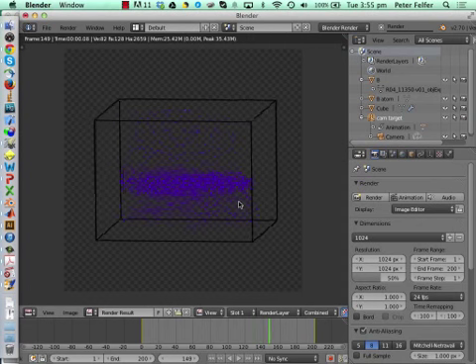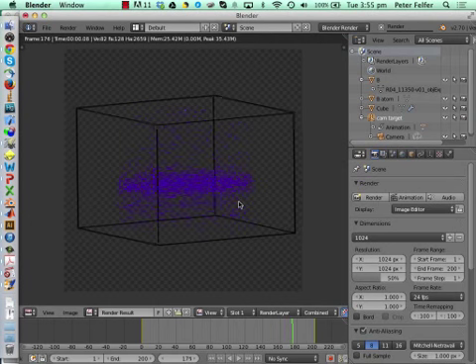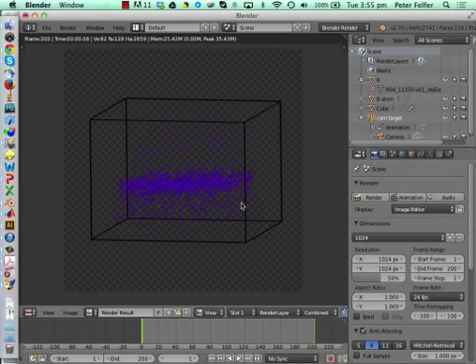If you render something a little bit more complex, you'll actually see it render one tile and then move to the next tile and render the next tile. But that won't show up in the final image. And that's it. It's rendered.